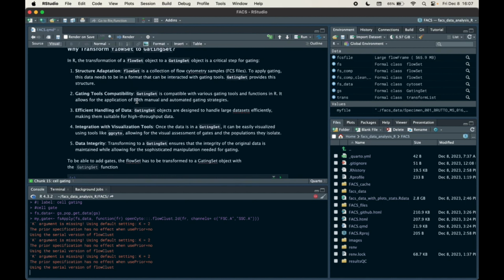I mean, if you are using commercial software, sometimes it is very difficult to understand what this commercial software does. Actually, it's kind of a black box. Even though they have a very nice manual, nobody bothers to read it. So maybe it's better to try it once in R and then go for commercial software to do the analysis, so that you understand what you are doing.